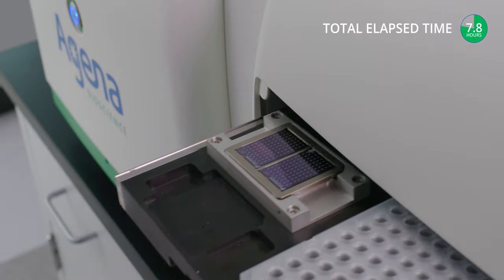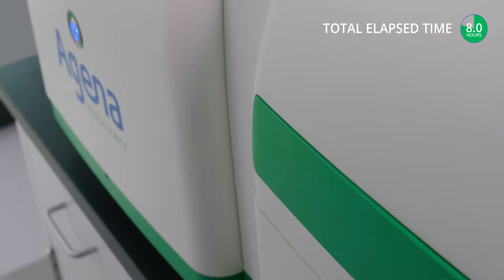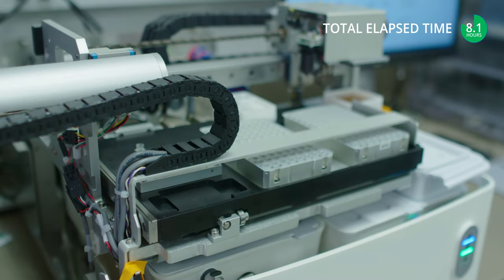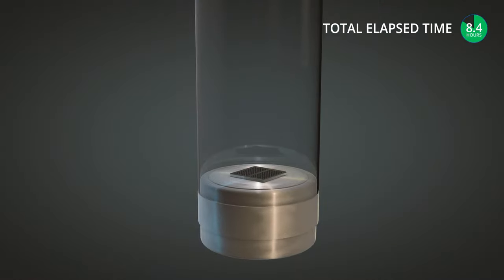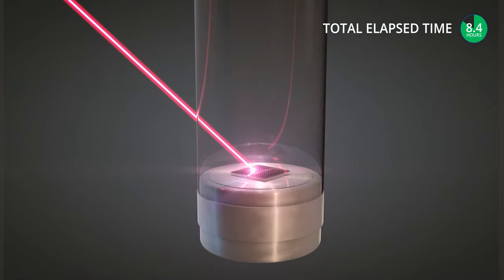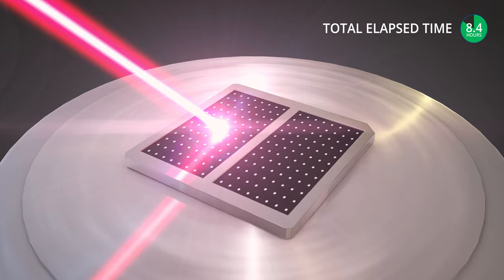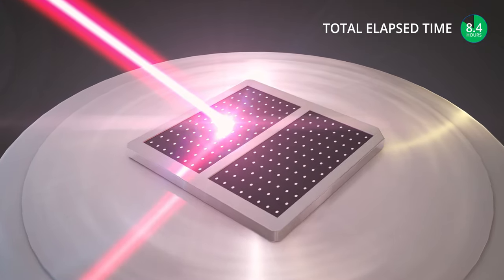Next, the plate is inserted into the mass array system, and the device transfers the sample onto the chip where the DNA extension products, or analytes, crystallize onto the matrix. The analyte crystals are irradiated by a laser, inducing desorption and ionization of the molecules within a vacuum chamber.